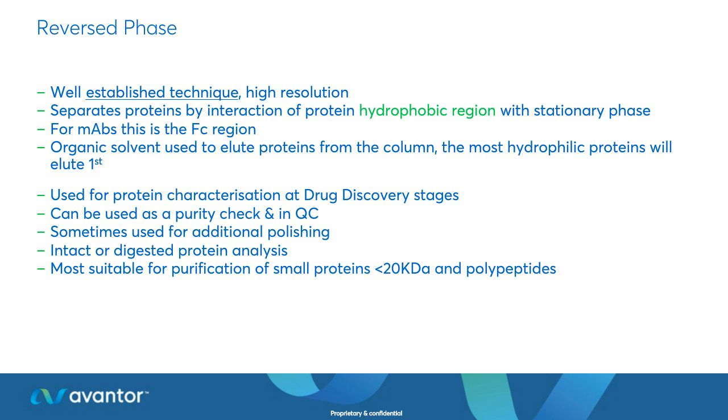It's good if you've got small to medium molecular weight proteins. So as I'm saying here, up to about 20 kilodaltons. If you've got really big proteins, if you've got things like viruses, then reverse phase probably isn't the best technique for those. But for our peptides, for our small proteins, it works quite nicely.